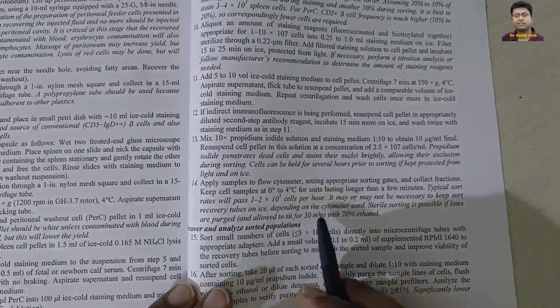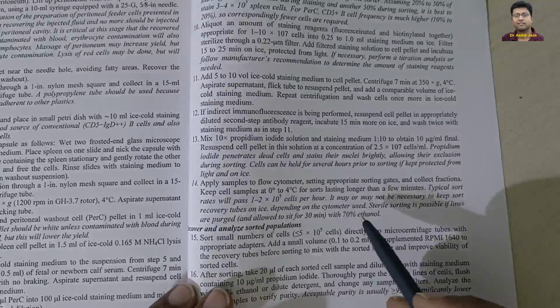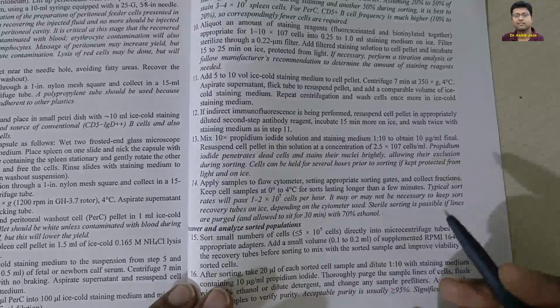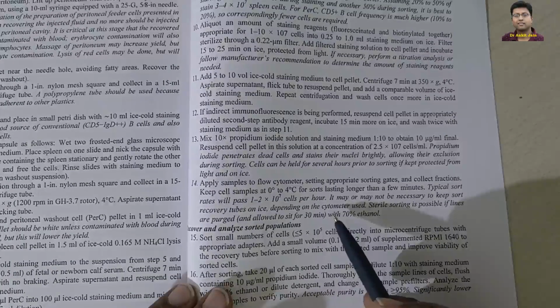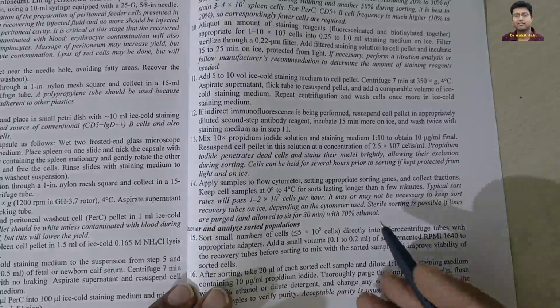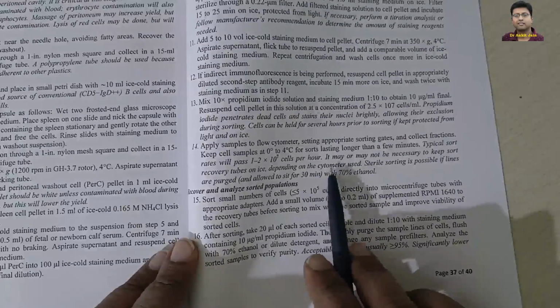तो अगर हमें सेल्स को रिकवर करना है, मतलब it depends on the flow cytometer. हो सकता है कि हमने flow cytometer में हमारा सैंपल डाला, सेल्स डाली, then it will be get distorted, it will be get destroyed। तो it depends on flow cytometer machine कि हम हमारा सैंपल फिर से रिकवर कर सकेंगे या नहीं, या केवल हमें एनालिसिस करने को मिलेगा, और या फिर हम हमारी सेल से हमारा सैंपल रिकवर कर सकते हैं या नहीं। It depends on all about the machine.